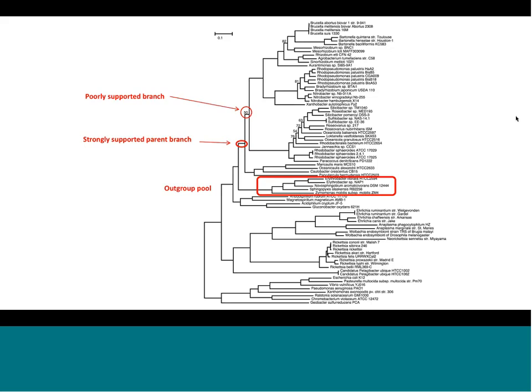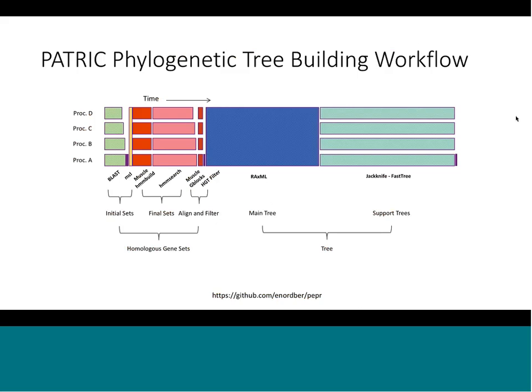So that's probably more than anybody wants to know, right? We just want to show me where to put my genomes in and give me the tree. That's generally actually how I want it to work, but sometimes there are some of us who want to know the nitty-gritty details, so that's how it's working. And this cartoon is showing you at each of the steps where the different tools are engaged in building the trees.